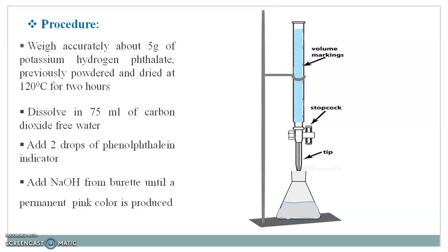Add sodium hydroxide from the burette to the conical flask until there is formation of a permanent pink color — this is the end point. You have to take 3 readings and then calculate the average. Suppose you get a burette reading of 24 ml; this reading is used for further calculations.